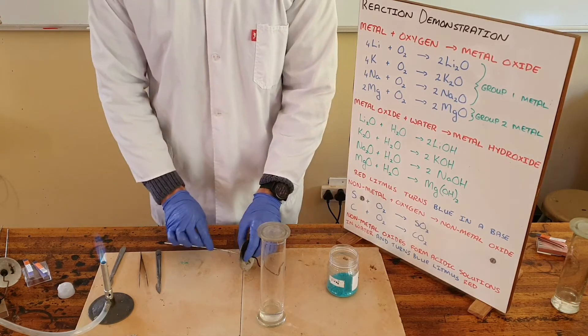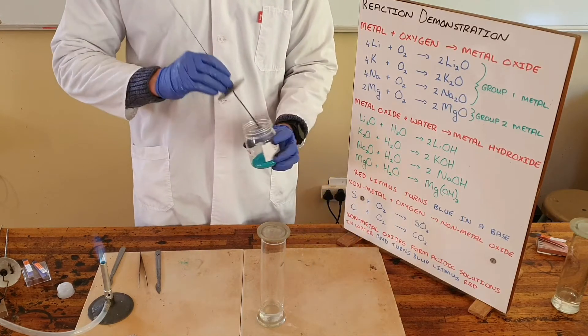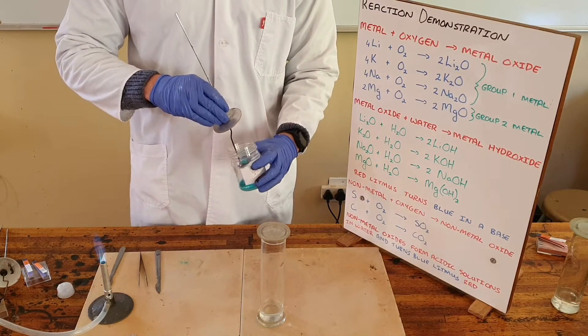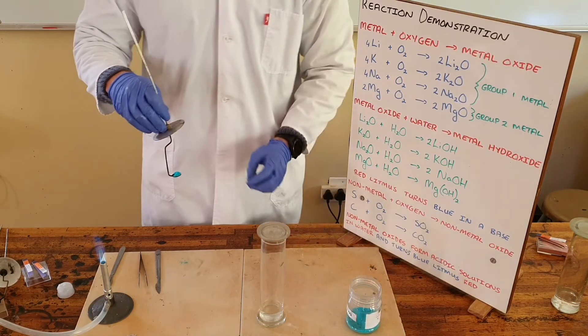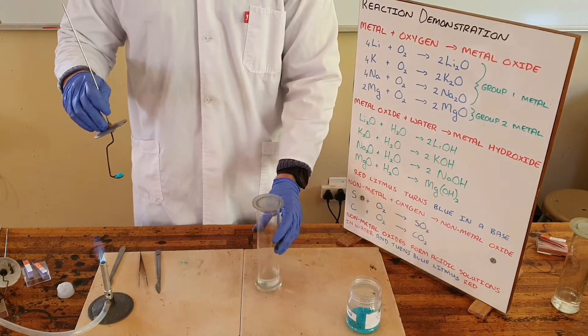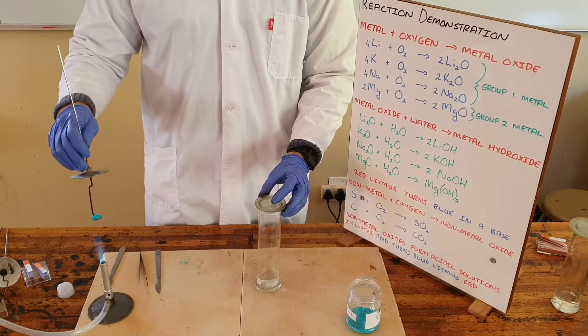What we're going to do now is demonstrate how a compound, in this case copper chloride, which is a combination of a metal and a nonmetal, which we would also call a salt, is burnt and combined with oxygen just to show that compounds also do react with oxygen.